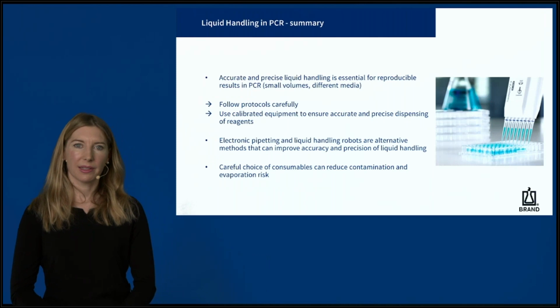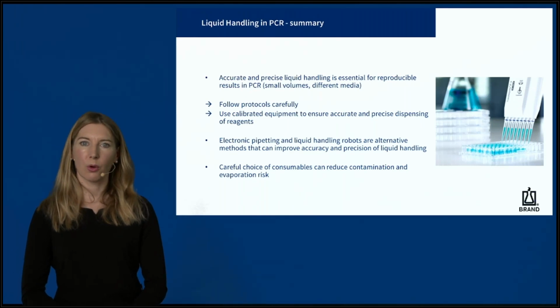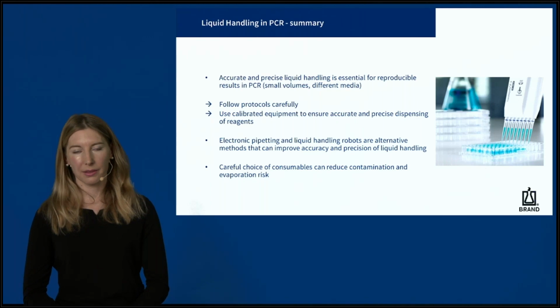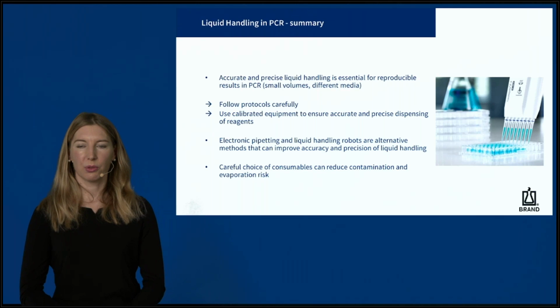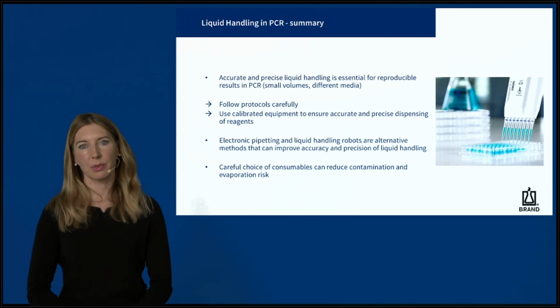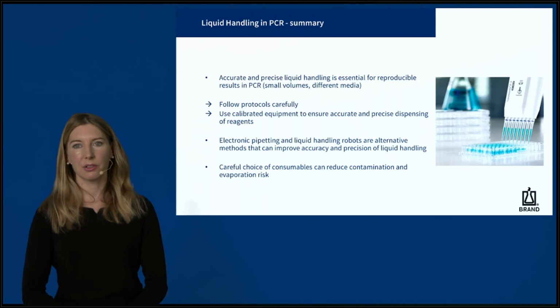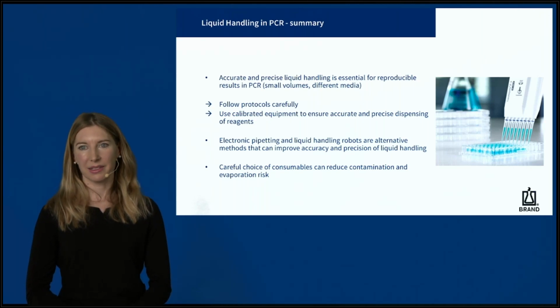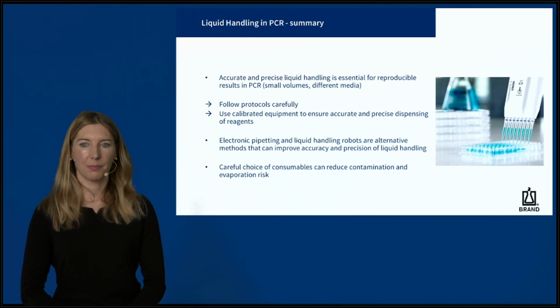Let's now summarize the outcome. Regardless of whether you work with an automated system or manual electronic pipettes, accurate and precise liquid handling is essential for reproducible results in PCR. Manual pipetting is a common method used in many labs, but it can be time-consuming and is prone to human errors. Electronic pipetting and liquid handling robots are alternative methods that can improve accuracy and precision of liquid handling.